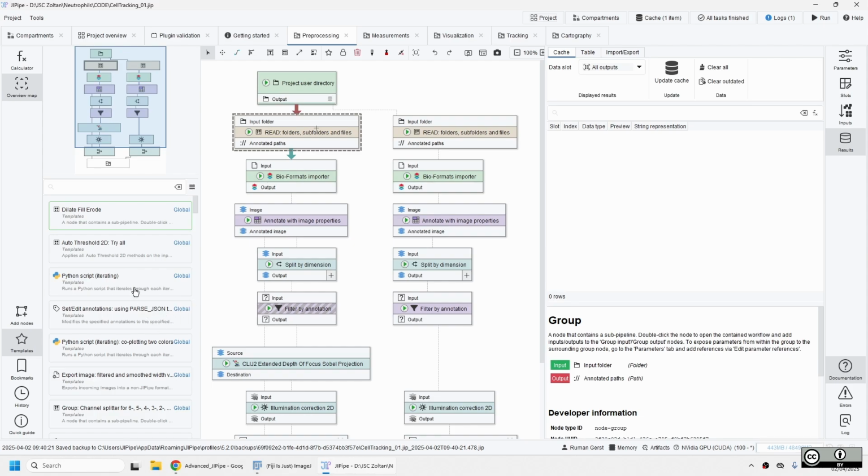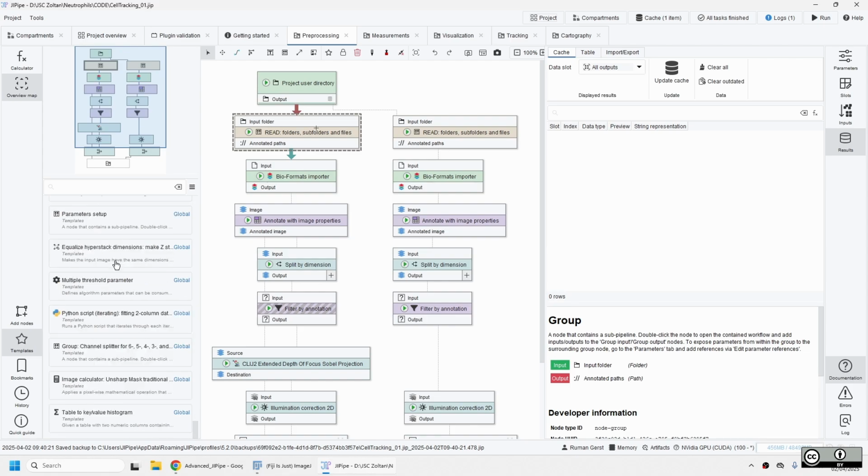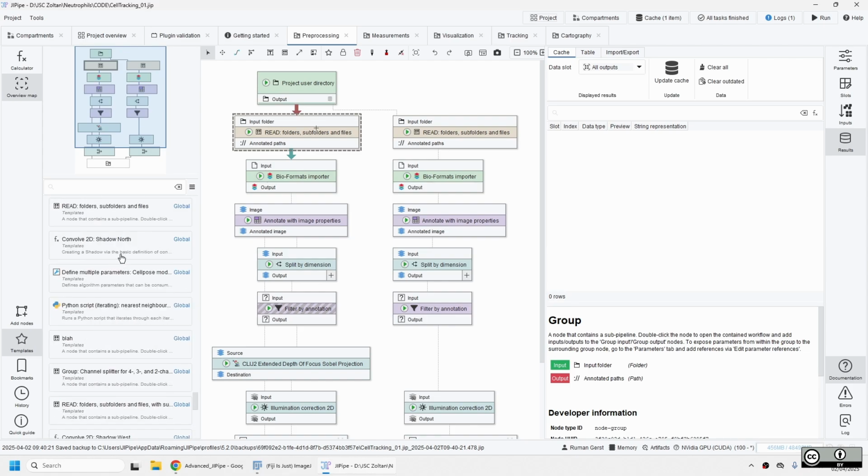So what happened here now is that suddenly in the templates tab, instead of having 2 sad little files, we have a whole bunch of them. We will not go through them, but this is for you, free to use as part of the course. These are the templates which I developed over the past couple of years. Many of them will have zero use to you. I did not go through them to select, because I don't know what you will need later. But you are free to go through them, and the names are typically telling enough that they will tell you what exactly they do.